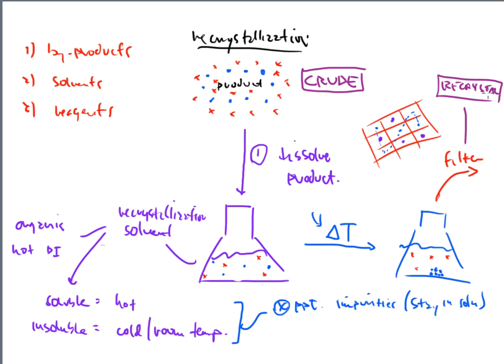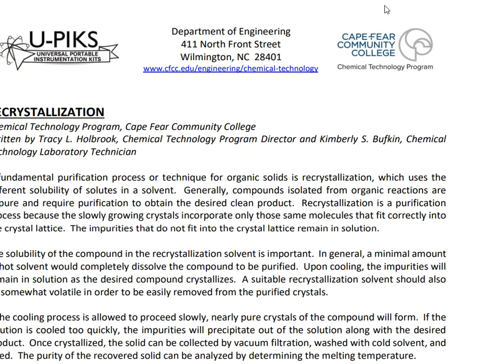All right, so this is the overall idea of recrystallization, and we do it very, very often, folks. I mean, every single thing that we do, it seems like if we're making a product, we have to go through a cleanup stage. We have to take our crude and we have to go to a recrystallized version of it, because if not, we're not going to get very good lab data in the very end. So, with that said, I want to kind of talk about the laboratory that you're going to be doing, which is a recrystallization laboratory specifically.